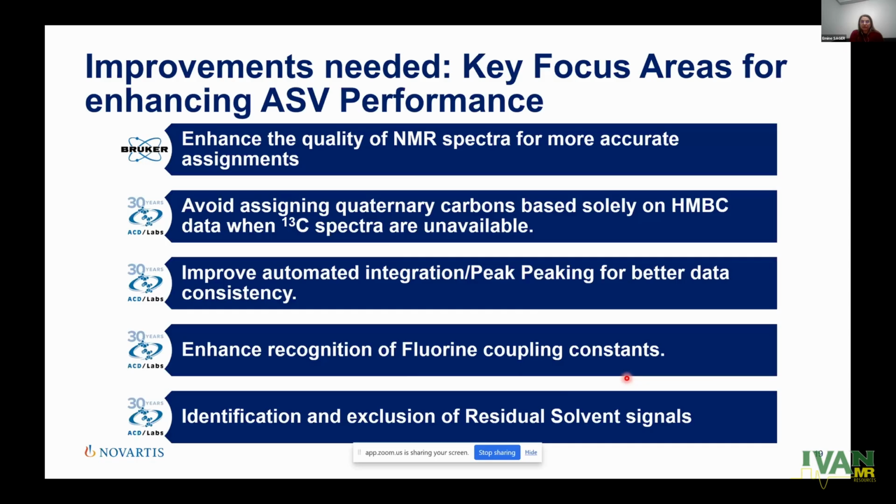Now, what improvements are needed? One thing is very important, this is the quality of the NMR spectra for more accurate assignment. We are still working on it. We have our in-house solution in order to increase or decrease the number of scans automatically in order to end up with high quality NMR spectra.